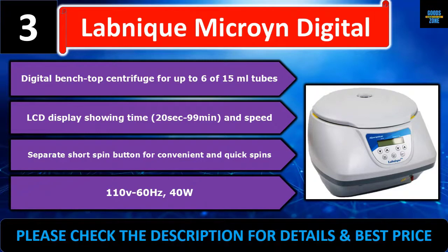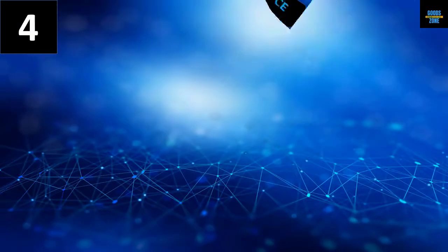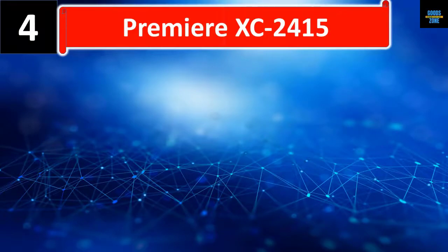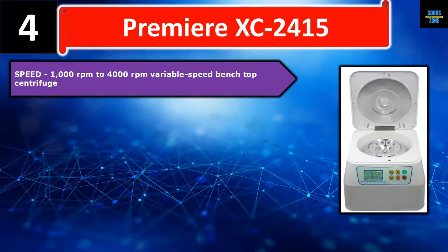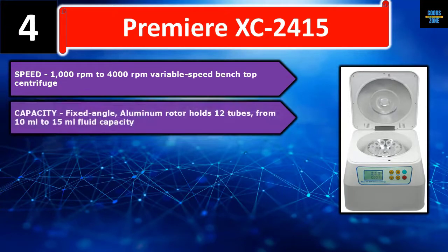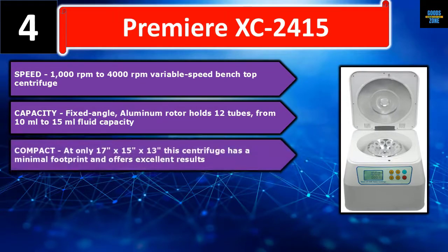Please check the description for details and best price. Number four: Premiere XC-2415 — variable speed benchtop centrifuge with speed range of 1000 RPM to 4000 RPM. Its fixed angle aluminum rotor holds 12 tubes from 10 ml to 15 ml fluid capacity.